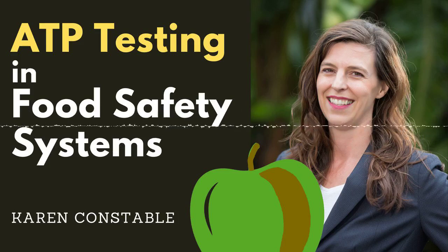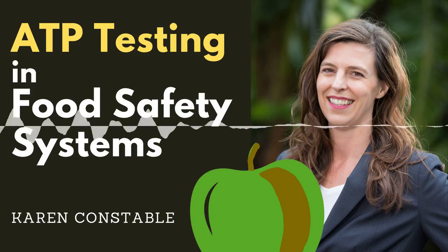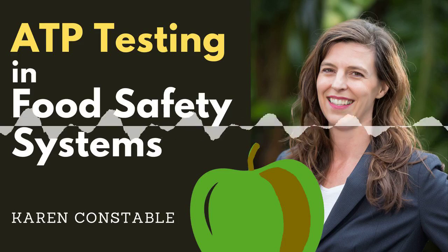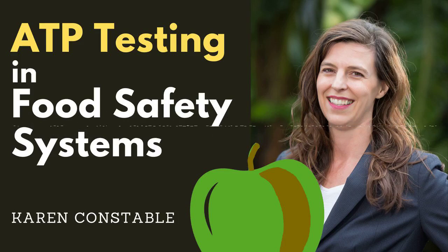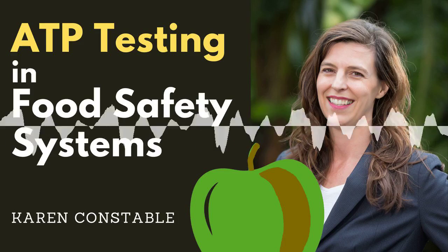What ATP tests cannot do: distinguish between living and dead organic matter, indicate the presence of low numbers of microorganisms or specific pathogens, indicate the presence of inorganic dust, dirts or fibres, enumerate bacteria or other microorganisms on surfaces.